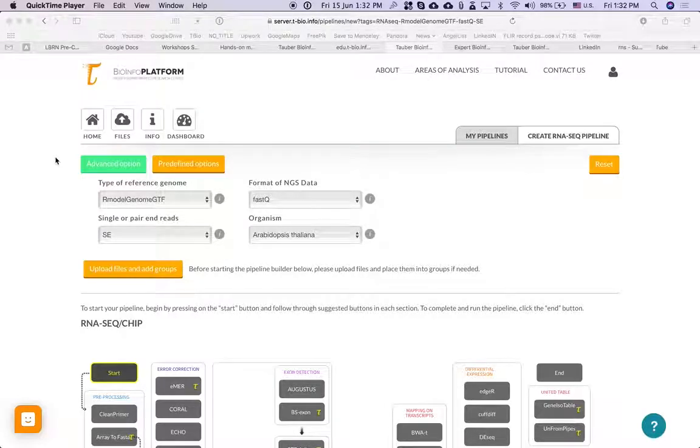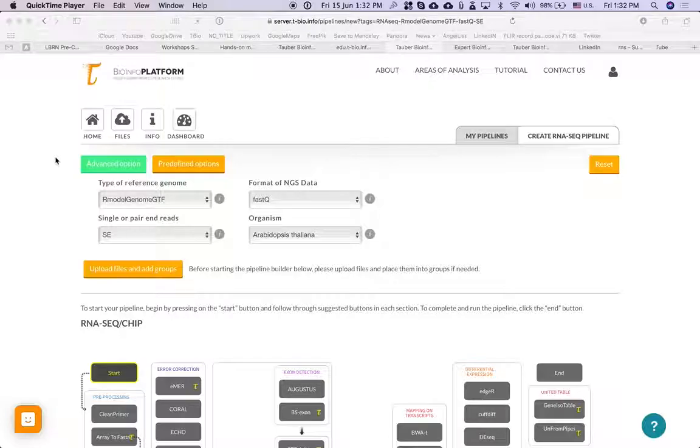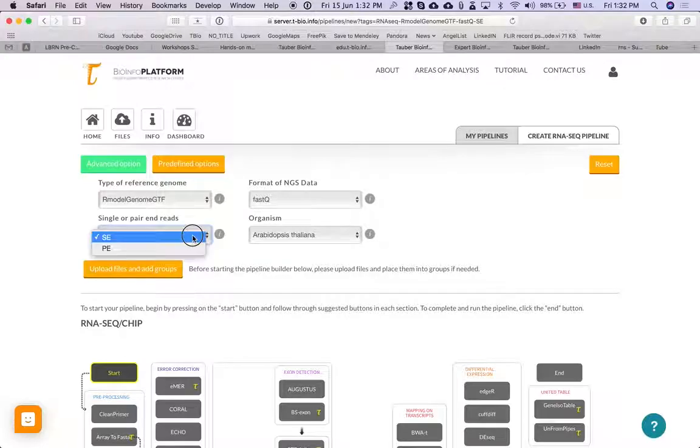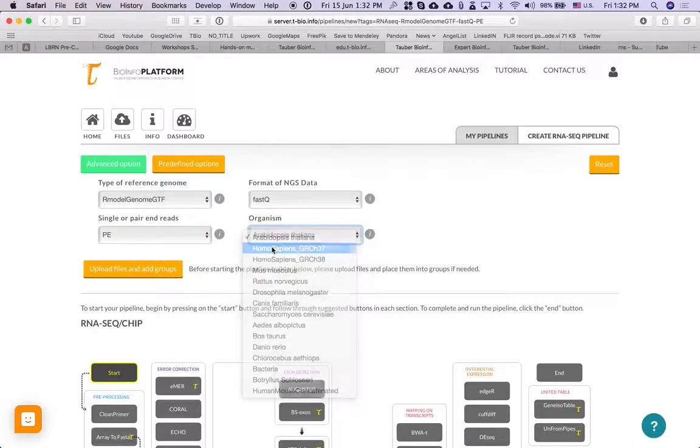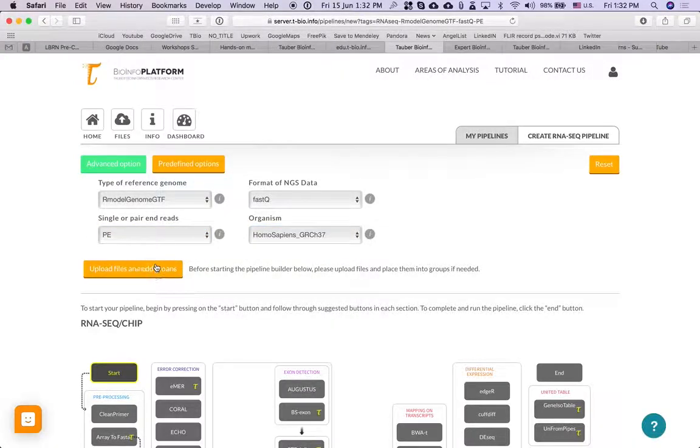How to create the simplest mapping pipeline so that you get an expression table at the end. Here I am in Create RNA-seq Pipeline. I'm going to select PE, FastQ files, and change it to human.